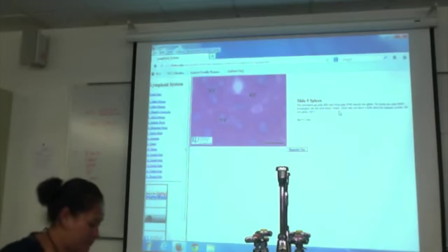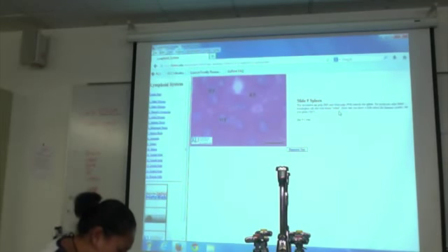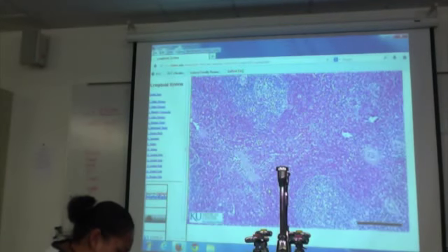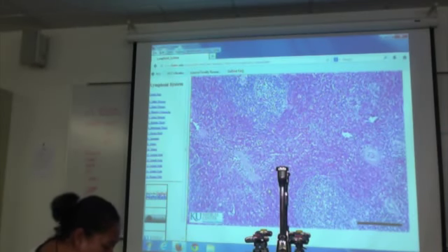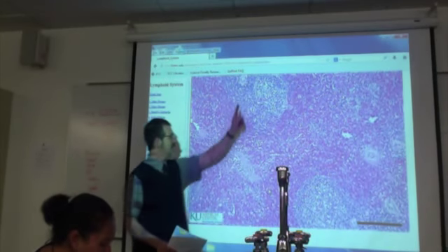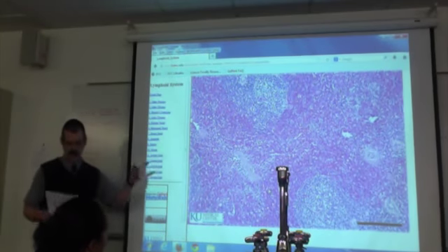That's how it is. So those are all follicles. Yes, but you don't call them follicles in this case. We're calling them white pulp and red pulp. Another view. You can still make out that there are dark circles and non-dark circles, but because they're scattered, I know that's a spleen, and therefore this is white, and this is red, because it's a spleen.